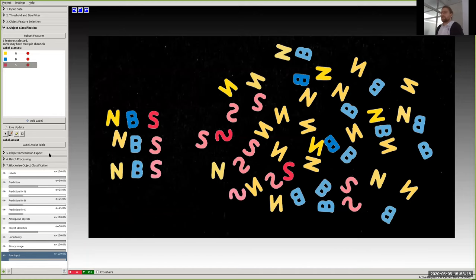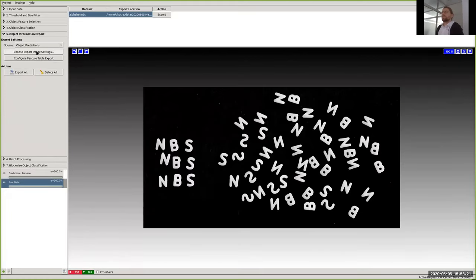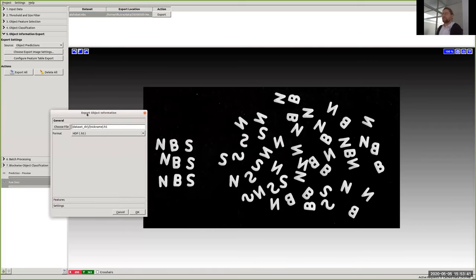From there you go to object information export. You can export two different things: an image, or a feature table. The feature table allows you to export all those numbers used during classification — all the features are in fact just numbers. You can export to CSV to open conveniently in Excel or Google Sheets, or export an H5 file, which is very useful for post-processing or advanced visualizations. You can choose which features to export, and for the H5 file you can also include either the whole image or smaller regions of interest around each object.